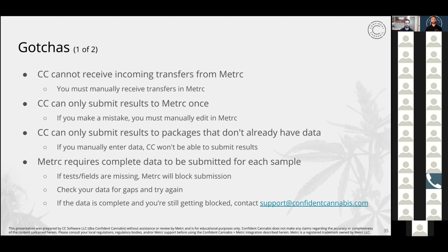And so just know that you have to have complete data before submitting. And if you attempt to submit and it fails, that doesn't mean you can't try again. You can enter the data and then try again. But if it's submitted successfully, then you can't try again. Yeah, and if you're having any issues and you're confused about what to do, just contact us, support@confidentcannabis.com.